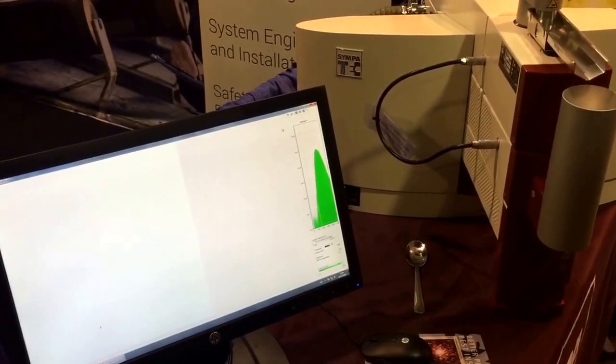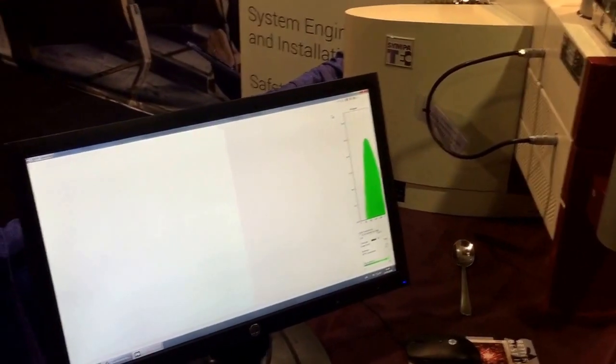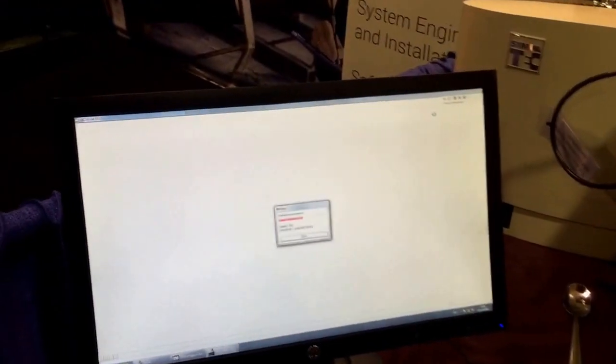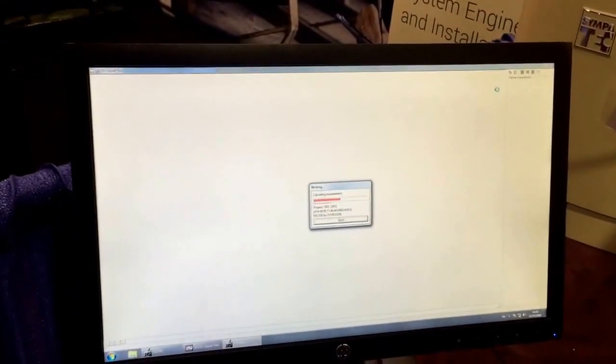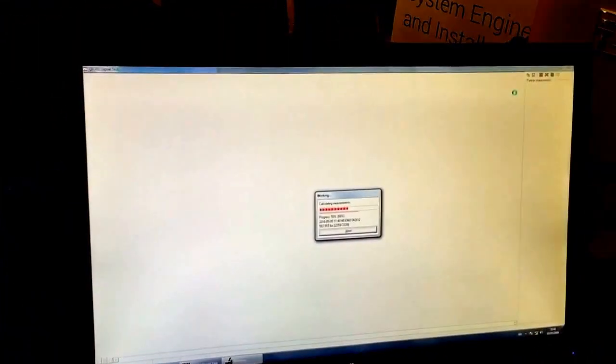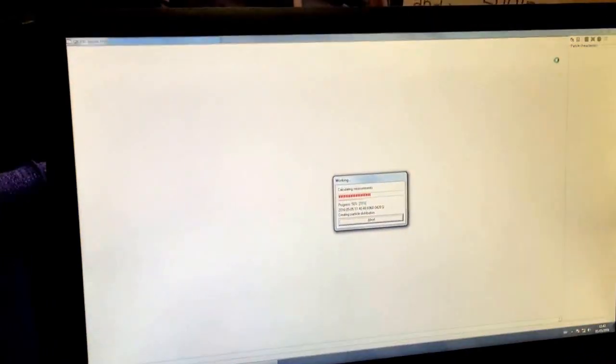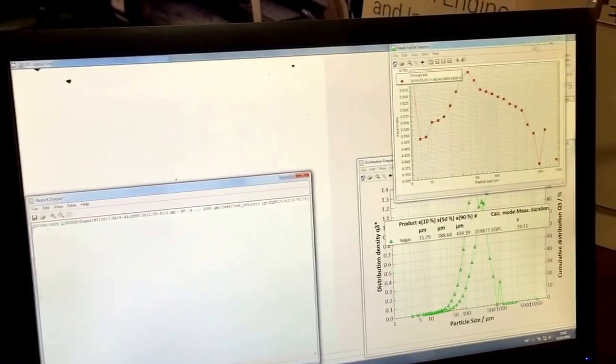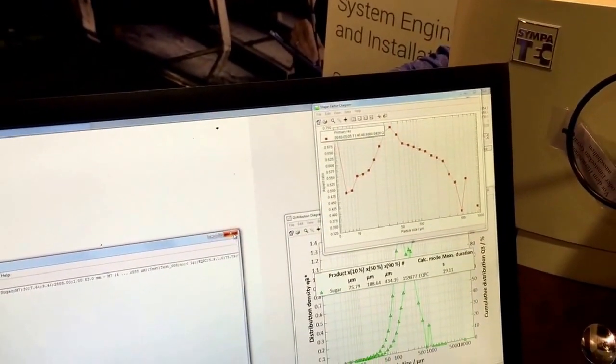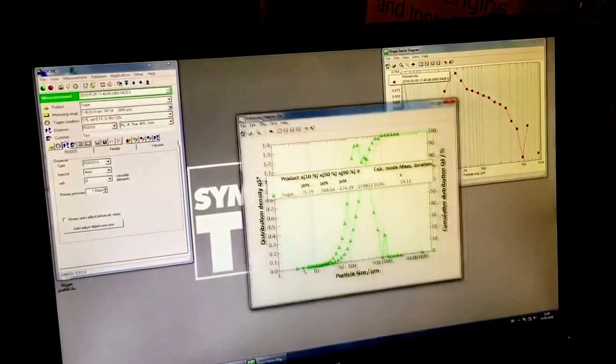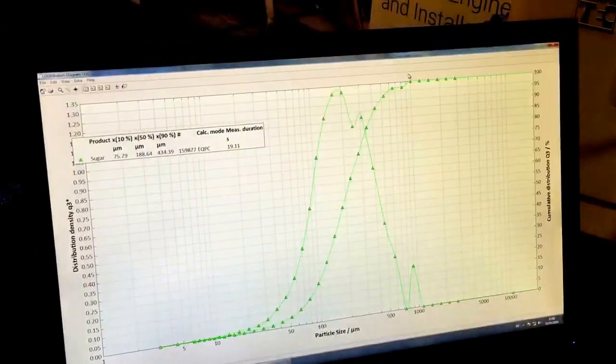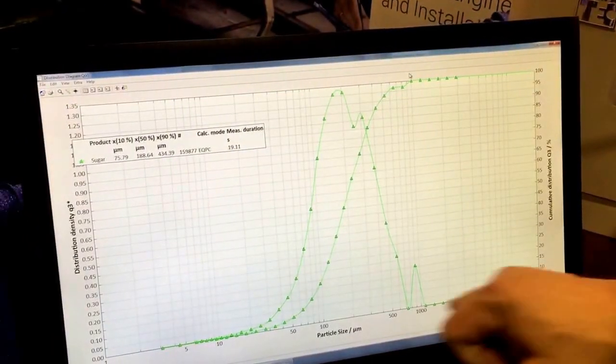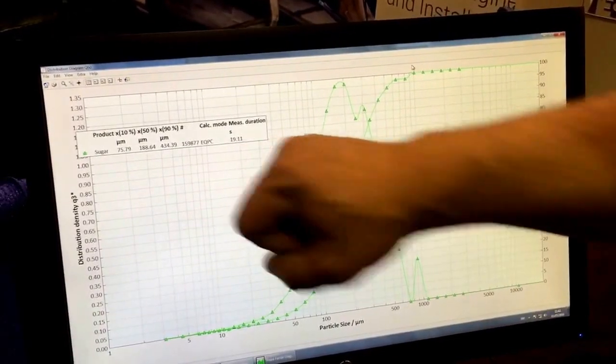It knows when there are particles in the measuring zone, it starts measuring. Then it knows when there are no more particles and it stops automatically. Now it cranks out the data, calculates the data, and now we're going to get some results. So let's take a look here. This is the size distribution.